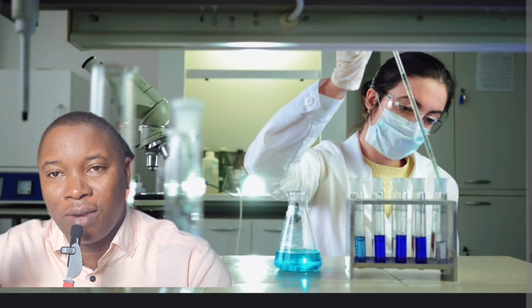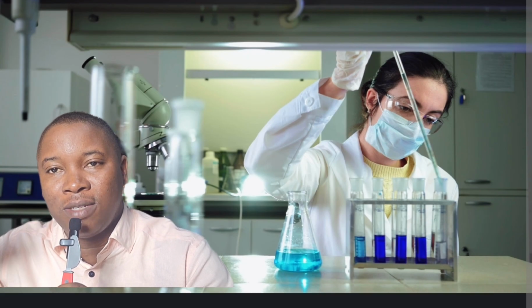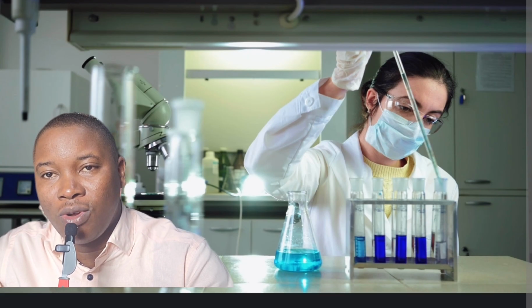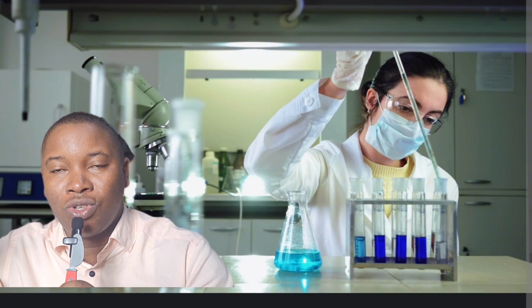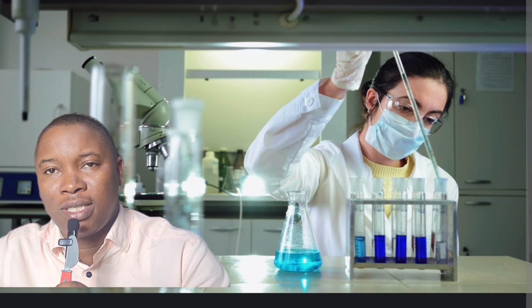So you have tryptophan, which is a type of amino acid. If it is broken down, it's broken down into indole, pyruvate, and ammonia. The presence of that indole can be determined by the use of the Kovacs reagent. I hope you understand it very well.